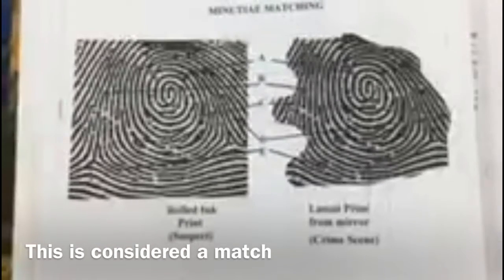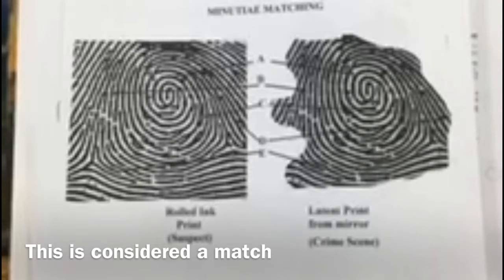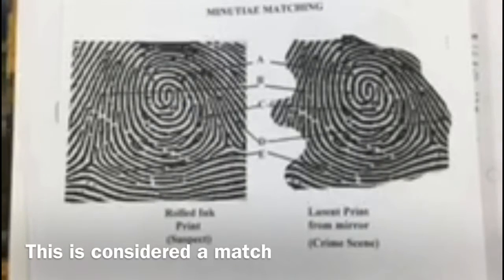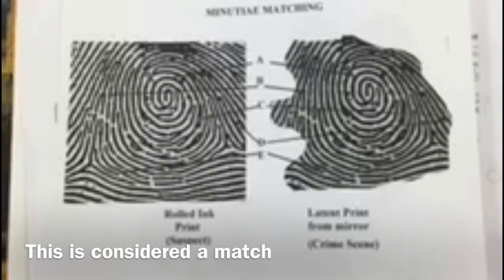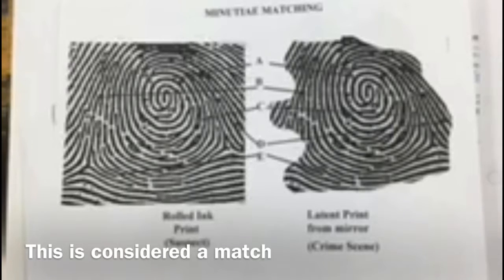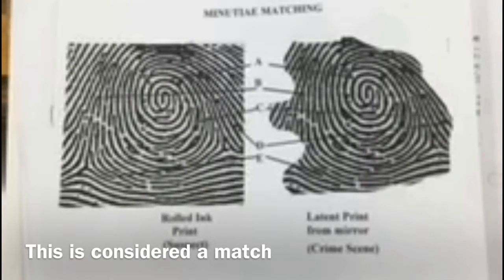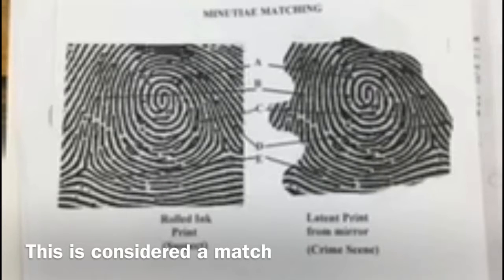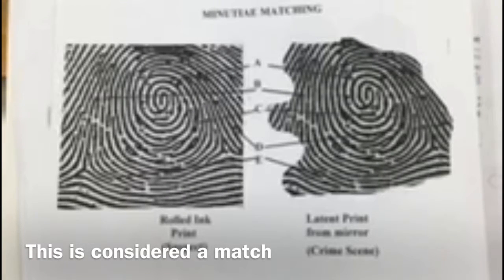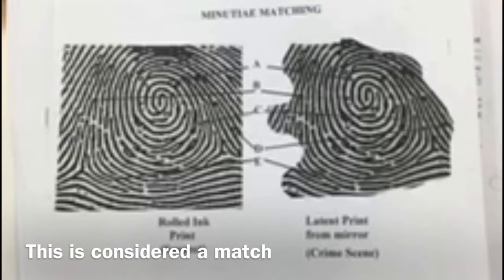We collected a latent print from a mirror. As you can see, there are some consistencies between the latent print from the mirror and the rolled print from our suspect. As you can see, both A's line up and show a dot. B also shows a bifurcation, C shows an eye, D shows a bridge, and E shows an ending ridge.